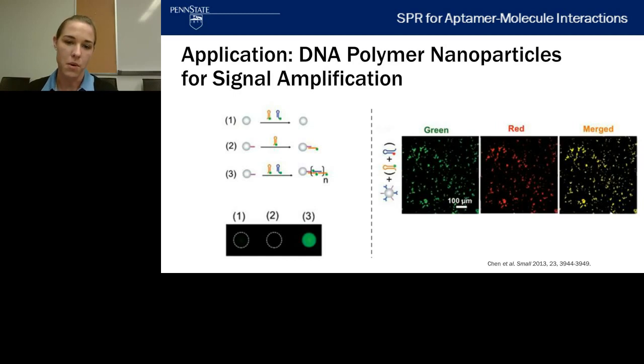In number 2, we can see that the initiator can be bound by monomer 1, but we can't see a large increase in fluorescence in 2 for the fluorescence image at the lower area. However, in 3, we can see that when both monomers, which have a fluorophore conjugated to them, are incubated with the initiator functionalized particle, a large amount of fluorescence intensity can be observed. So this shows that the use of the polymers with the fluorophore attached to each monomer can create a larger fluorescent signal than one fluorophore per reaction site.